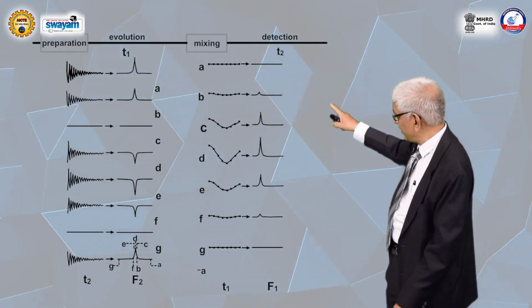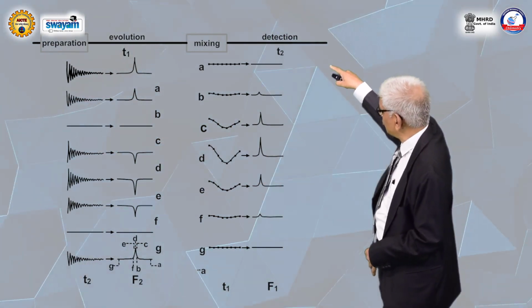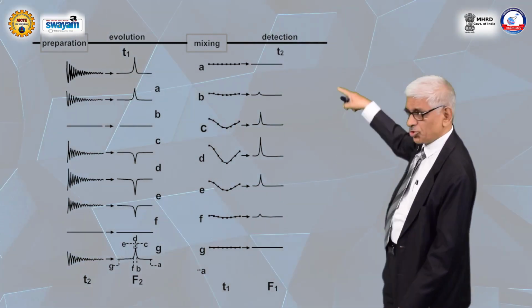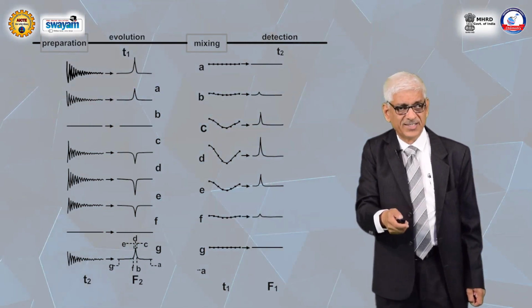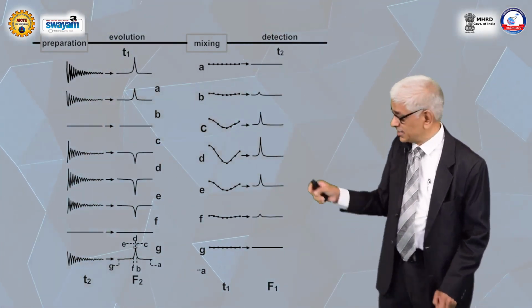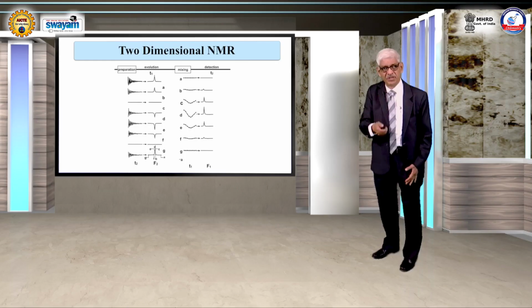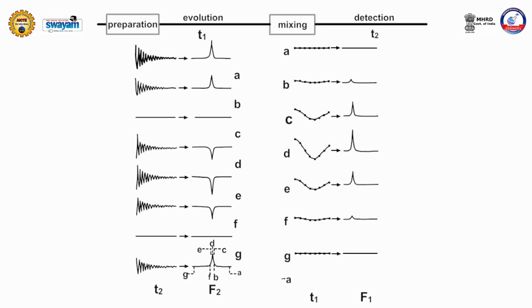One has a positive intensity, then a negative intensity, some have 0, then it again picks up positive, negative, and so on. Therefore, if I go from bottom to top, these traces at different points along the spectral region are plotted on the right side of the picture, and you can see that they also undergo a time-dependent modulation.